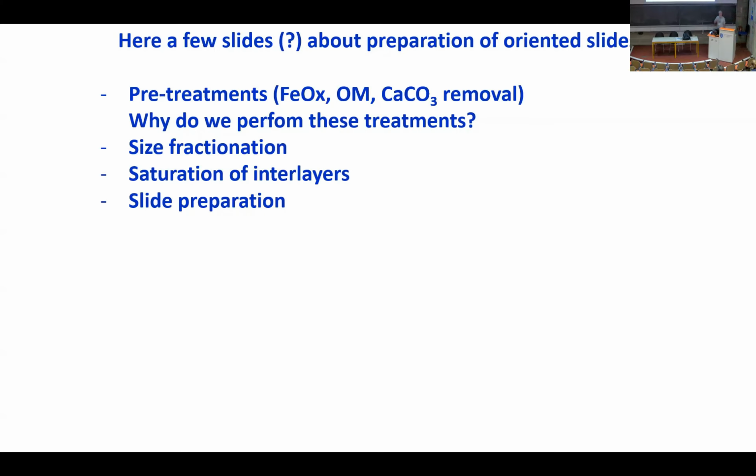In this case, you are not losing anything by recording a sample in which you have both clay minerals and small iron oxide glued on your clay minerals. We just change slightly the size fraction you will be looking at, but usually you are reporting less than 2 micron fraction, not less than 2.00 micron fraction.